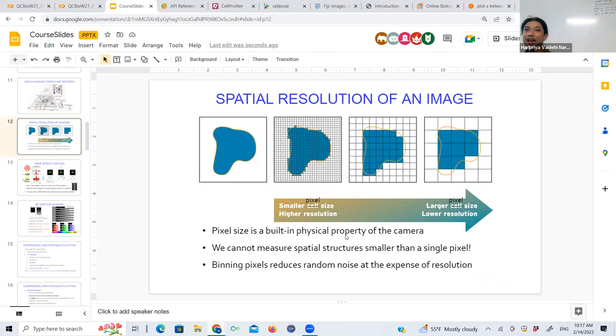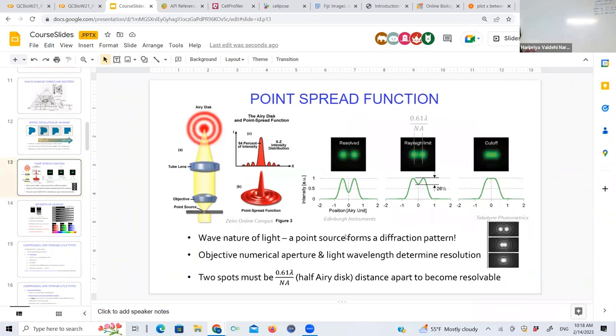So I guess you maybe didn't expect that. You thought X and Y and intensity are independent things. No, they're slightly related. And when you take your images, you've got to take that into account.